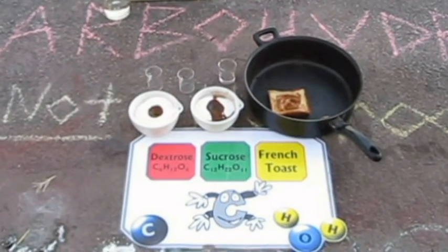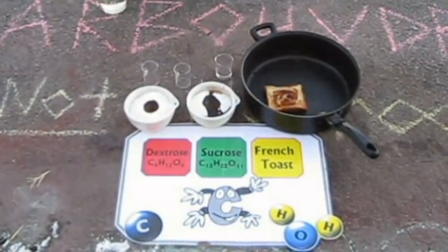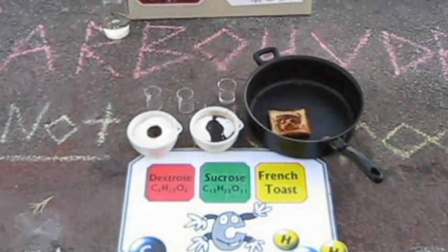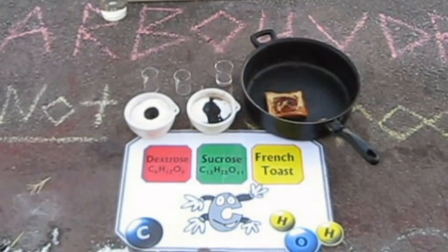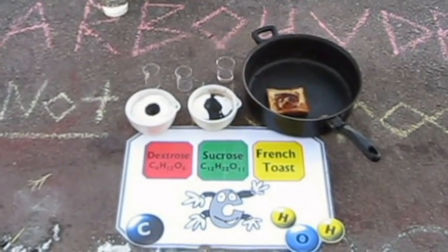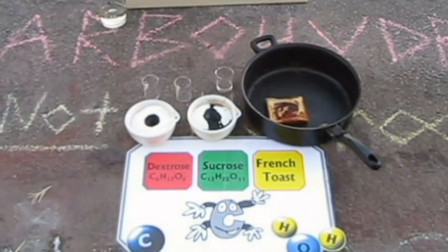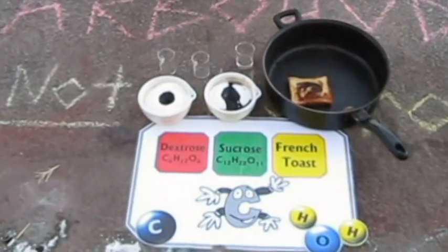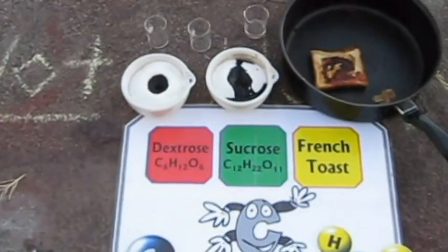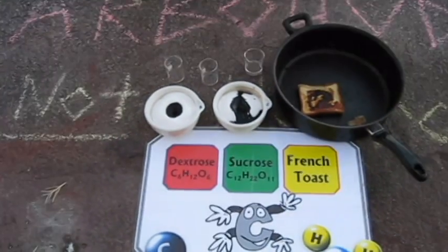Sulfuric acid versus carbohydrates. Sulfuric acid is acting as the catalyst. We're going to remove the water. And what are we going to be left with, Mr. Guerra? Carbon. Just the carbon. So if you didn't believe there was carbon, let's move closer now. If you didn't believe there was carbon inside that very white sugar, well, here it comes.